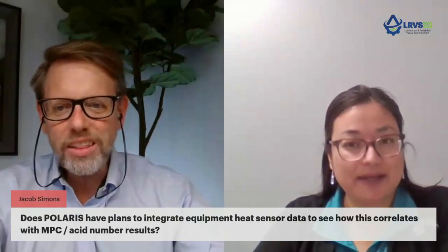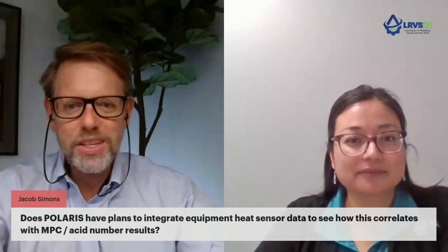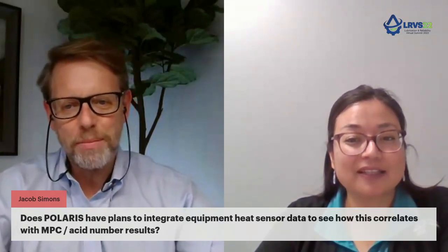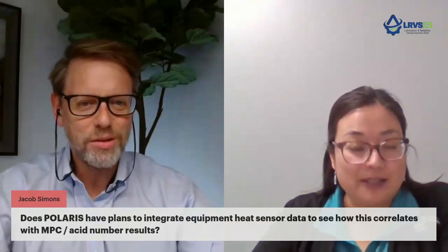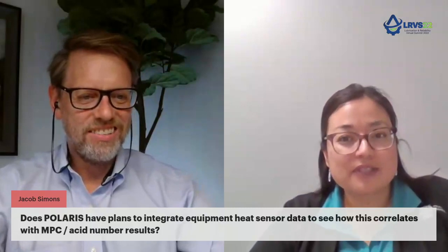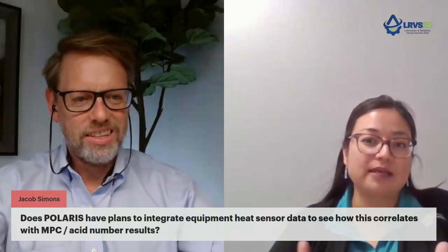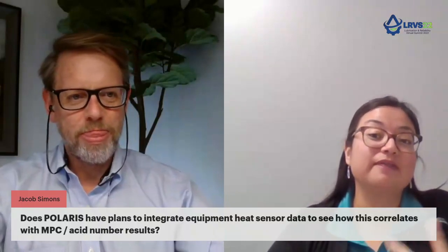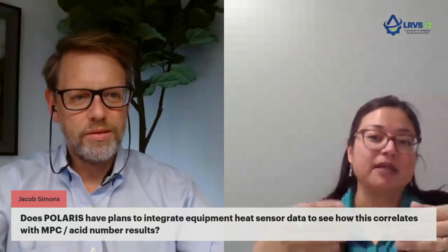But we have a question here coming up. This is from Jacob. Does Polaris have plans to integrate equipment heat sensor data to see how this correlates with MPC or acid number results? Interesting. In the future. So we currently have a service called Data Connect, where we can connect to the CMMS systems of the customers, and we're looking to advance that technology. Basically, their data feeds into our systems, and then we pull that data. So it's a push-pull system of data information.